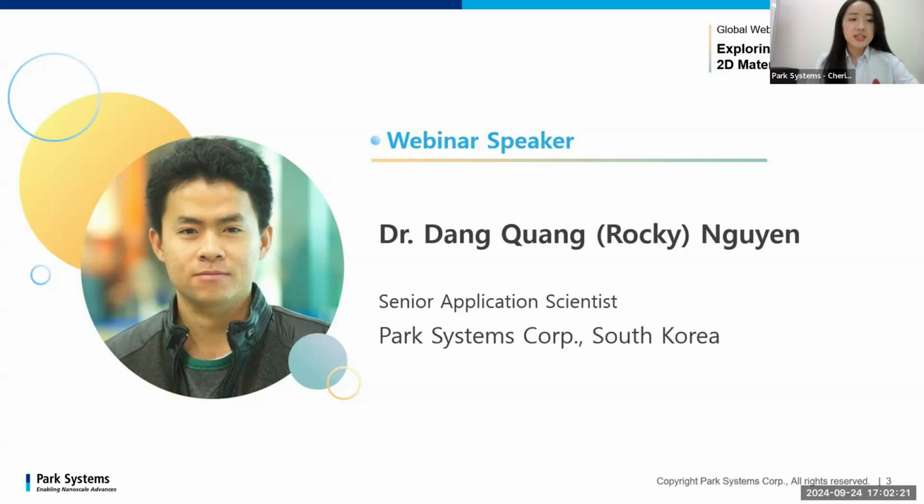In today's presentation, Dr. Rocky will be discussing how combining ISE and AFM techniques provides a comprehensive understanding of van der Waals heterostructures, with a special focus on trapped bubbles and their impact on the optical and electronic properties of twisted bilayer graphene on hexagonal boron nitride. These microscopic trapped bubbles act as local optical cavities, modifying the refractive index and absorption properties of the material, which is critical for applications in optoelectronics and photonics.